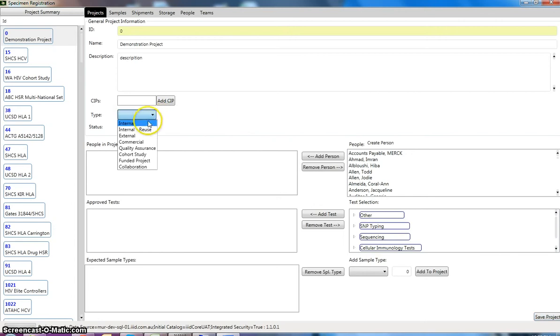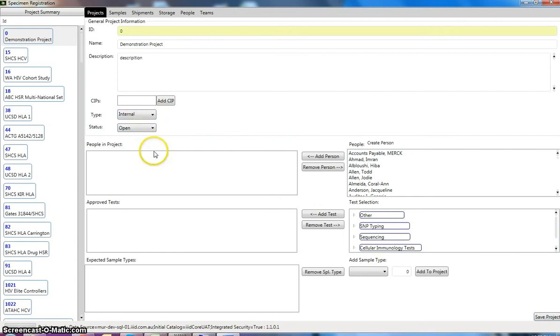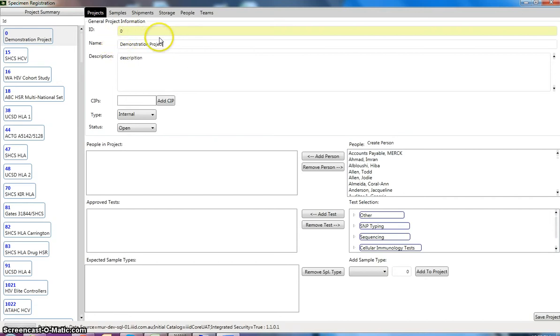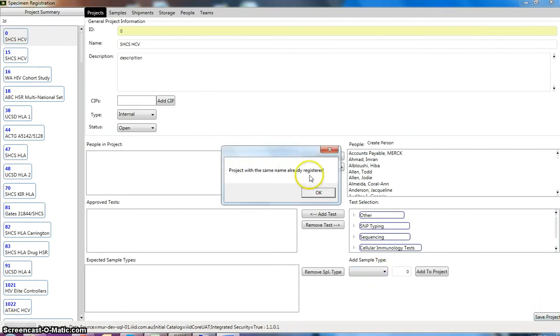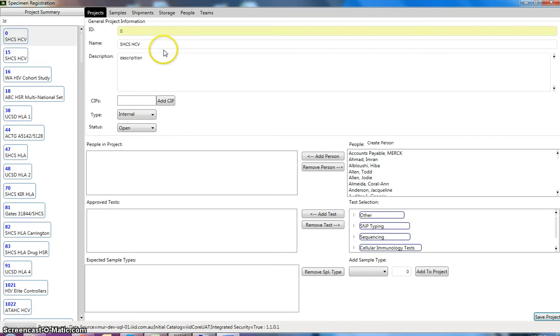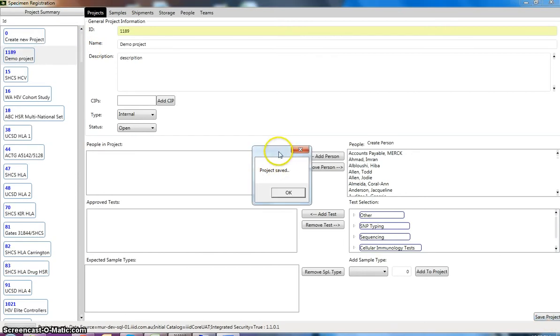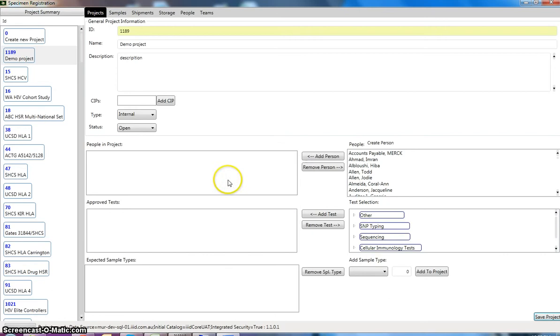So we'll choose a type and a status. The system will automatically also detect if we've already had a project of the same name. So if I put in SHCSHCV which is the name of an existing project, all existing projects are listed in this left panel here. So it should tell us that a project with the same name has already been registered. So if I change that back to demo project and click save, it should come up with project saved and give us a project number which in this case is 1189.